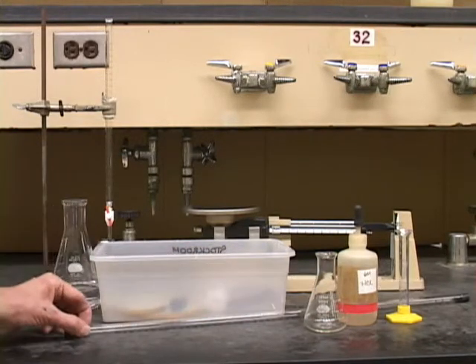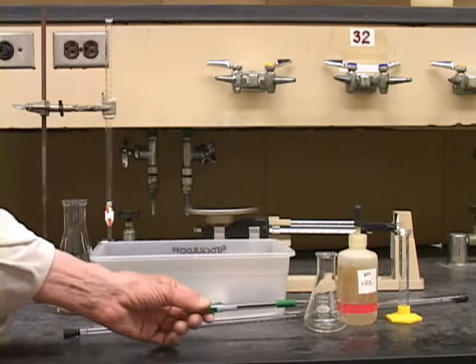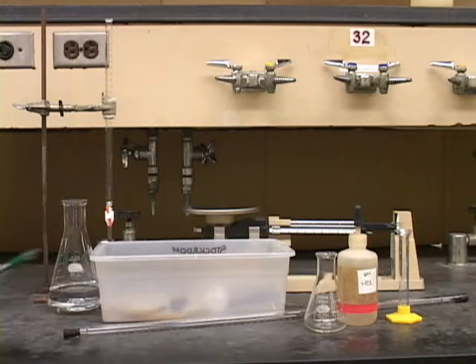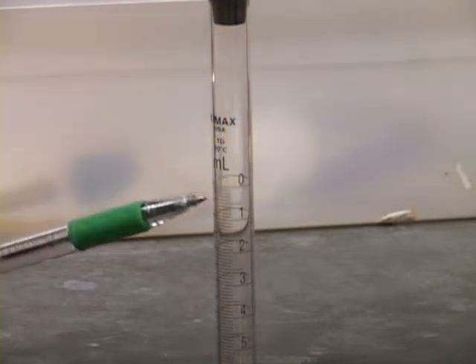So, once again, here's the agenda. You will calibrate your gas burette. You will make 1 molar HCl by dilution and standardize it by titration. Then you will run the experiment to determine the equivalent weight of your metal. You will use a burette to collect and measure the amount of hydrogen gas released by your metal.